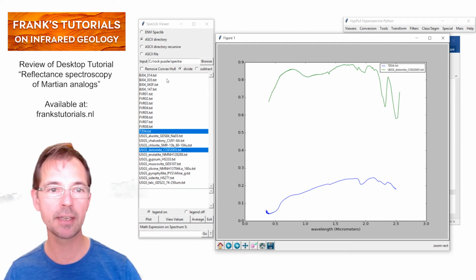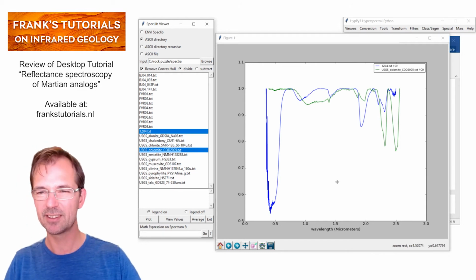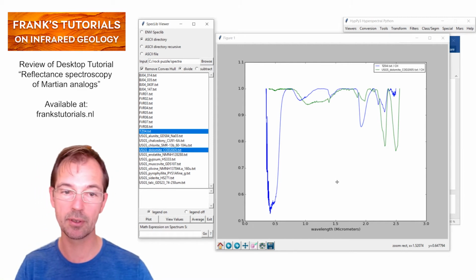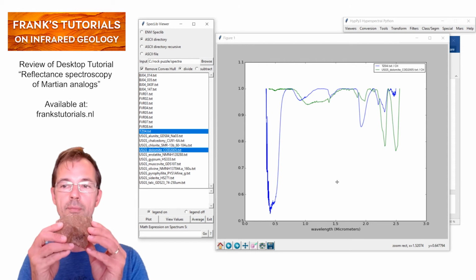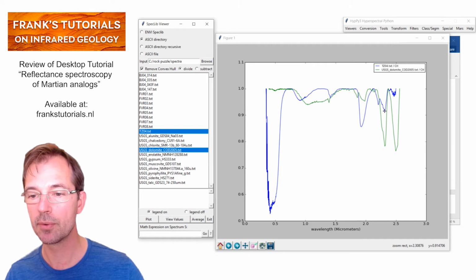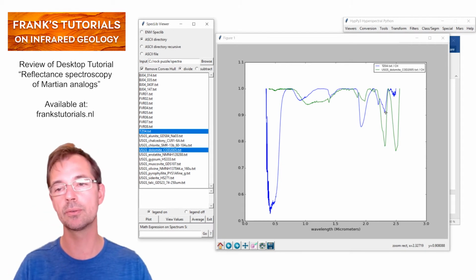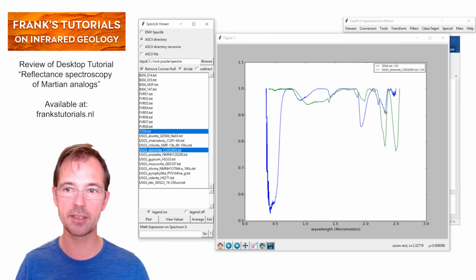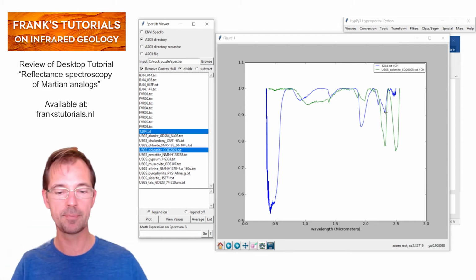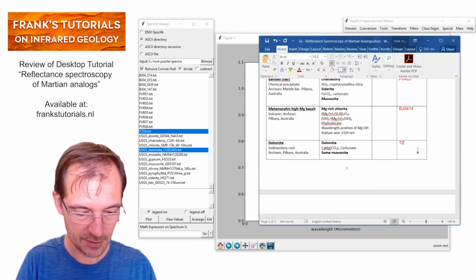This doesn't make it very clear, so we'll do continuum removal. And then what we see, there's quite a bit of differences between the spectra, because it's not a pure dolomite, this rock. But it does have a dolomitic feature here, 2.308. Yeah, and also the shape is somewhat asymmetrical, so I think we get a somewhat positive match here. It's not very convincing, but yeah, we can call this a dolomite. So that's TZ04.